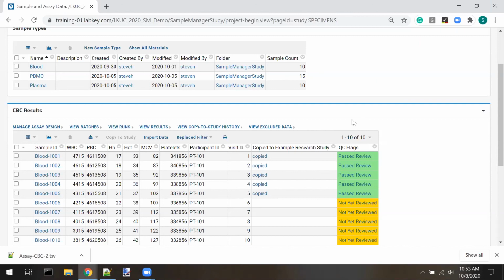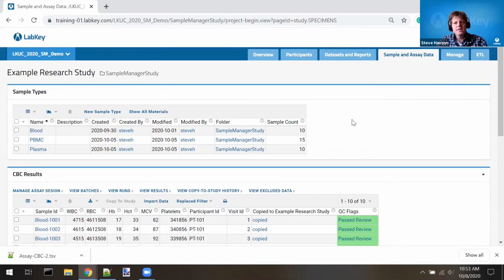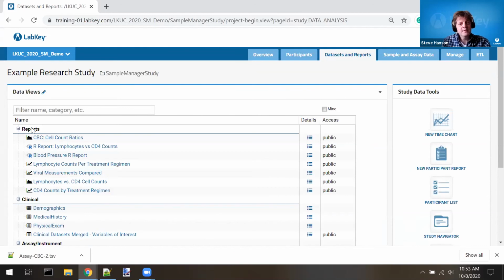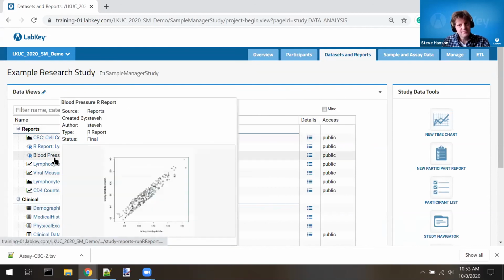And then a couple more questions here, since we have the time. There's a person who's interested in adding visualizations to LabKey Server. Are the web part visualizations, I'm assuming that they're talking about, unique to Sample Manager, or can they be created just within the server? Well, certain visualizations, really the ones that you make your own out of your own data, that's really LabKey Server functionality.